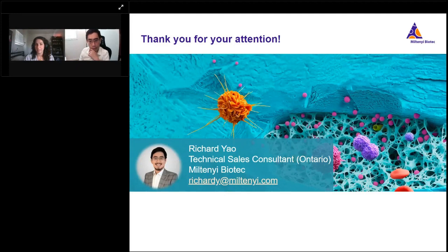Let's see, the next one says, my lab performs HSC CFU assays frequently, but we do not perform flow cytometric analyses. Would it be difficult to implement the StemMax HSC CFU assay kit, or should I continue performing the traditional assay with a microscope? Well, like I tried to explain in the slide, and my 2 cents, of course, is you should definitely consider switching.